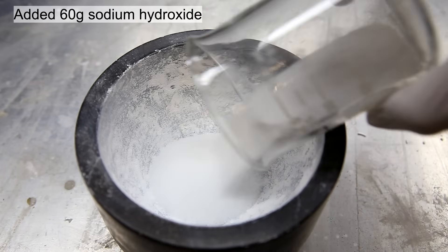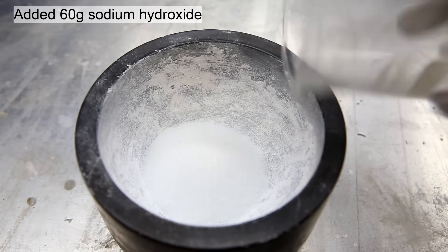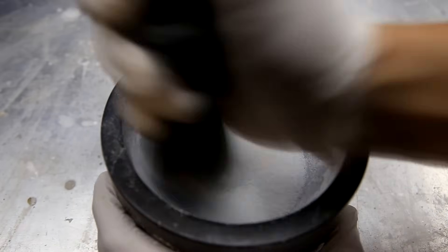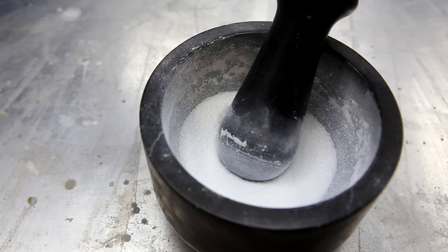Next to grind was 60 grams of sodium hydroxide beads. Here the mortar is much less full so it was a lot easier to grind. Eventually nearly powdered sodium hydroxide was obtained.